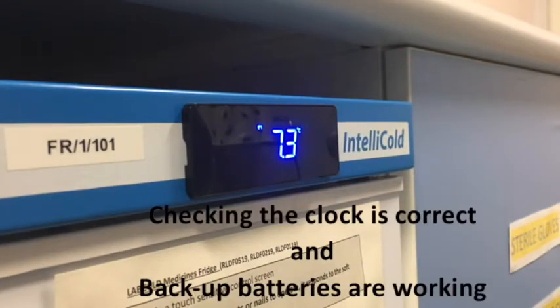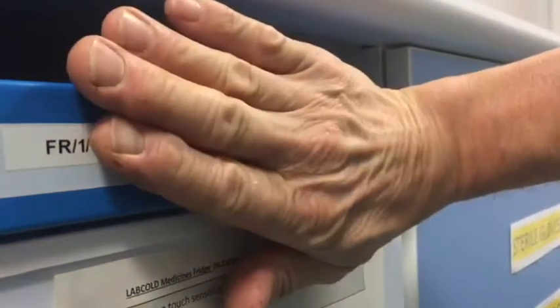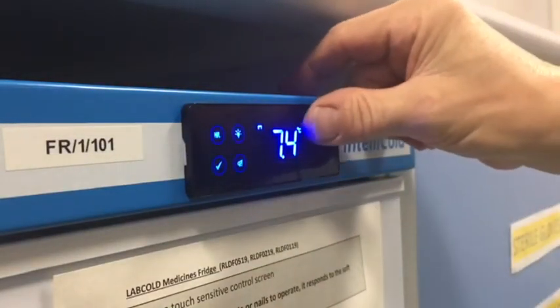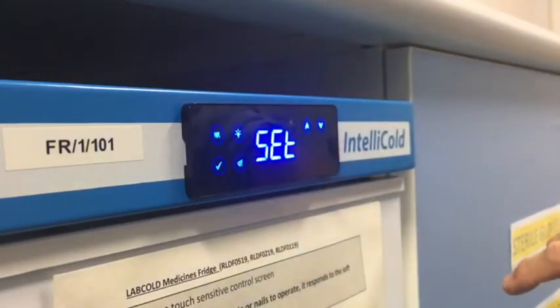Each refrigerator has an internal clock with backup batteries. Make sure you have an accurate date and time to hand, for example on a smartphone. Hold your hand against the display to wake it up, palm side to the display, then touch the up and down arrows simultaneously for a couple of seconds.